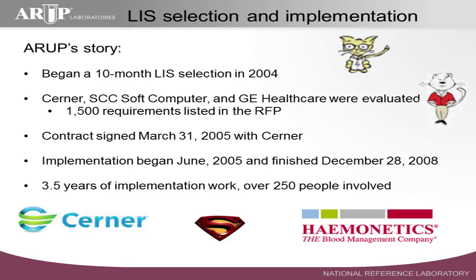And the reason the Superman sign is up there is we had this concept of a super user. We involved these individuals early in the project, and they were trained before anybody else and really were taught the ins and outs of the system. And we tried to get enough representatives from all the different laboratory divisions so that they would have some experts in their area. Because when you need help with an information system or anything, who are the people you go to? It's your coworkers, right? And so we thought these super users would be really valuable in their areas, and it turned out that's exactly what happened.